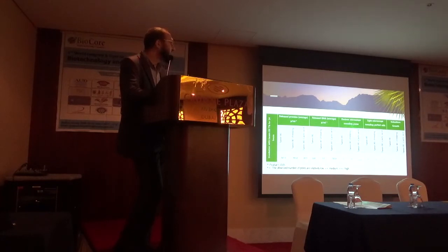By electron microscope investigation, using Tween we obtained numerous pores. Using freezing, there were more pores. Using Tween plus lactic acid, we obtained a very large amount of pores. By light microscope, the integrity of cells is positive in all.